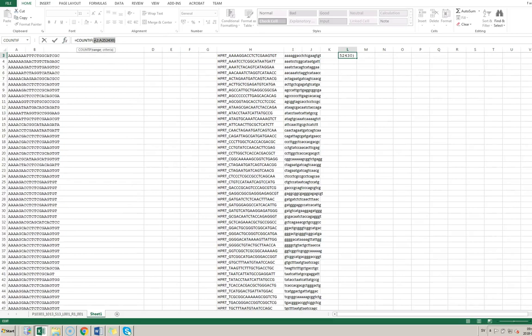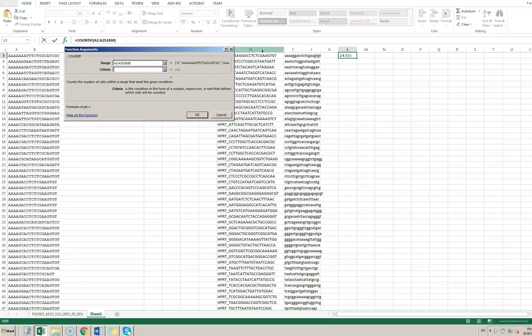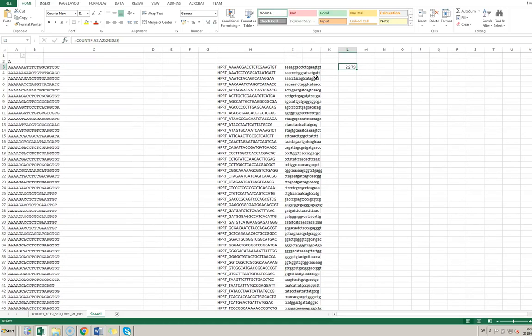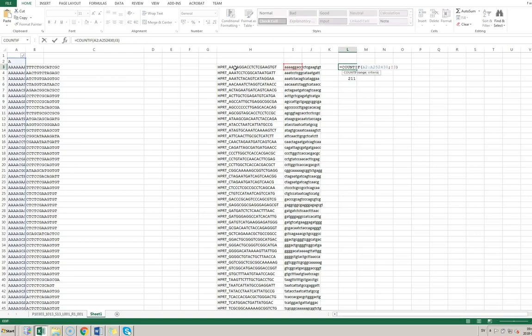I'm going to set up the COUNTIF formula — the range is the full column of extracted sequences and the criteria is the reference guide RNA sequence. For example, one guide RNA appears 2,279 times. When I pull this formula down for all references, the problem is the range will also change, so I need to lock it by pressing F4, which adds dollar signs and fixes the range while letting the criteria cell change.